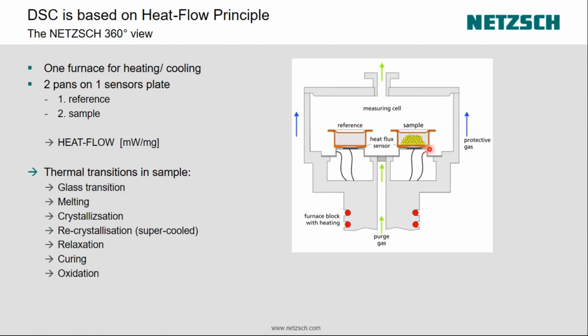So for DSC, internationally, aluminum crucibles are used for the test and for the experiments. We have the sample crucible made up of aluminum, whose lid is pierced, and the sample goes inside the sample aluminum crucible here. The reference also has an aluminum crucible, but this crucible will always be empty. And then we have individual thermocouples for both the sample as well as for the reference.